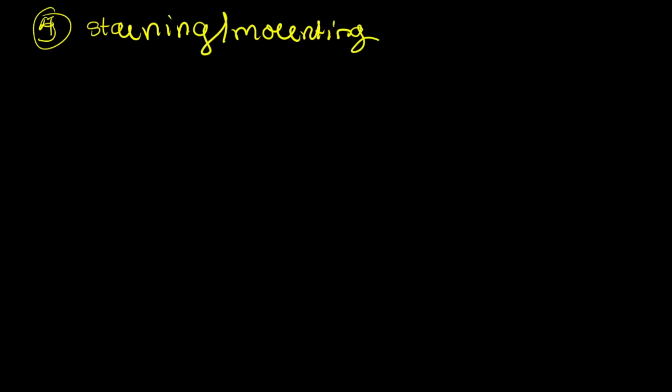The next step in the paraffin technique, which is step 4, first we consider tissue sampling, then fixing, then paraffin embedding, which had about 4 steps, and then sectioning, and now we are at step 5, which is staining and mounting. Now in the staining step, we no longer have a tissue block.